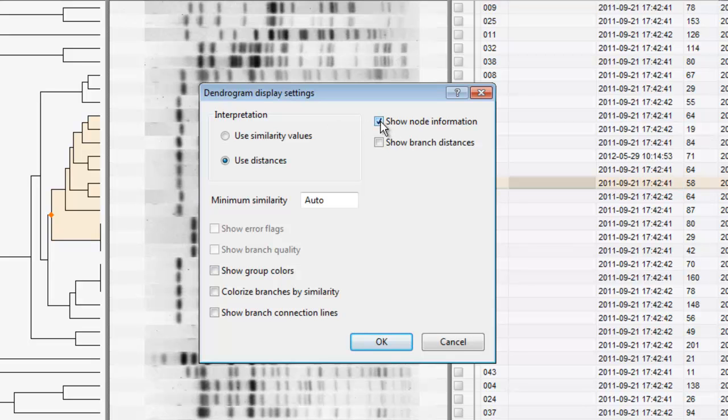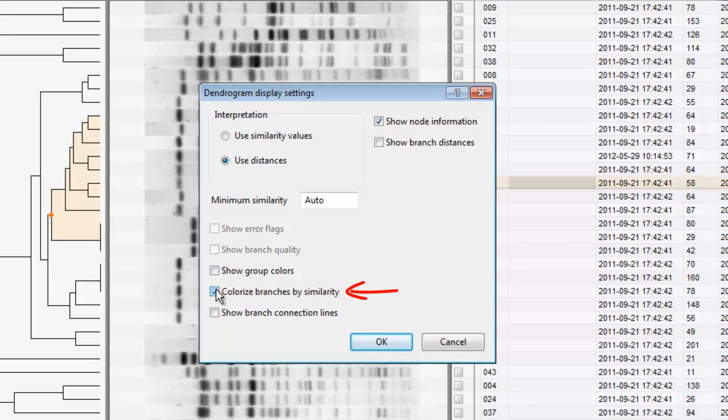If groups are defined using colors, I can show the group colors on the branches. As there are no groups defined yet, we will illustrate this feature later. I can fill the branches with a color according to the branch similarity. In case of an unrooted tree, connection lines can be drawn between the branch tips and the right edge of the panel, so that it is easier to link entries to their corresponding branches. I press OK to apply the changes.